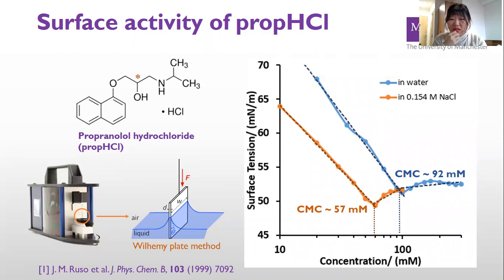The minimum around the CMC in the surface tension curve can be referred to surface active impurities, probably, as one never sees this in this case. We have already purified the drug before we measured it, but it seems that we need further purification.